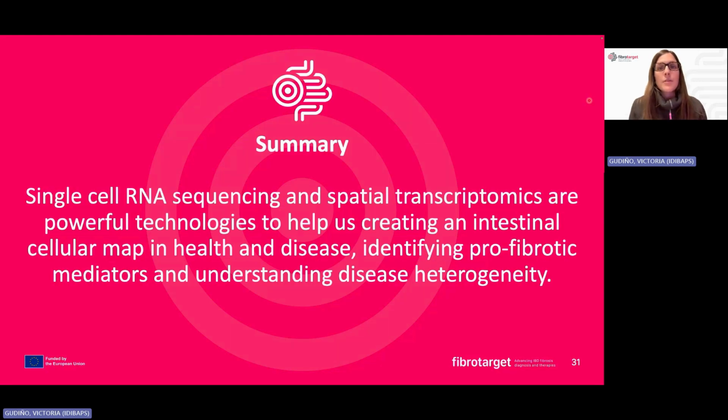So altogether, we can state that single-cell and spatial transcriptomics are powerful technologies that can help us to create an intestinal cellular map in health and disease. They can also help us to identify pro-fibrotic mediators that could potentially be targetable in the clinic, and also help us to understand the intrinsic heterogeneity of this disease.